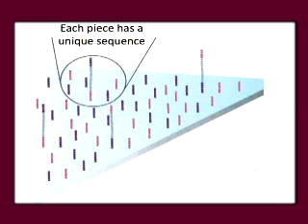There are millions of pieces of input DNA spread out over the surface of the flow cell, and each has a unique sequence. However, we can't yet sequence the DNA because there's only one copy, so we go through a process called bridge amplification, which is just another type of PCR to amplify the DNA so there are many copies sitting in the same place in the flow cell.